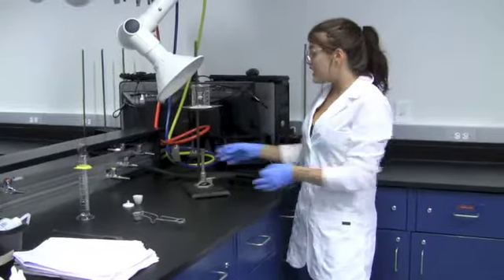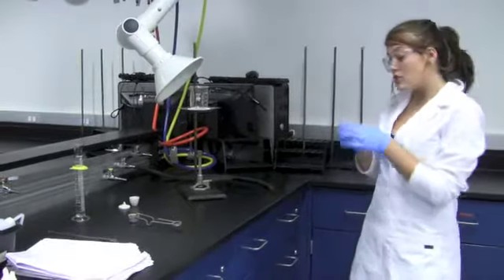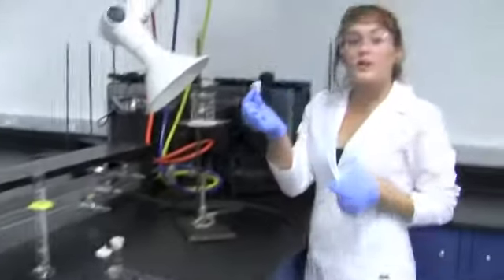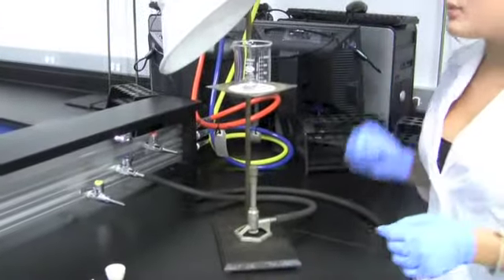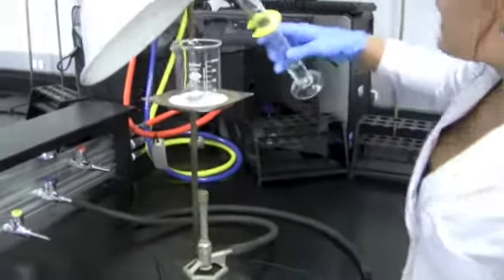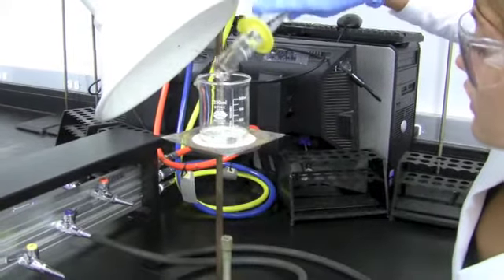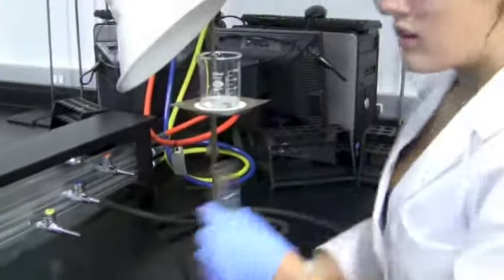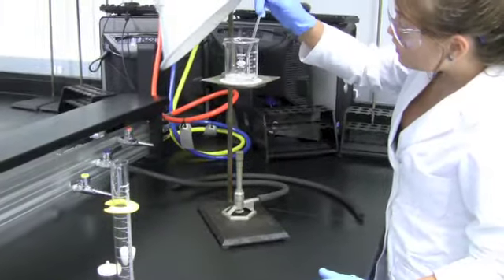So as you can see, I've set up my lab table so that nothing is close to the edge. Now to proceed with the experiment, I've folded up my aluminum foil. I'm dropping it into a 250 milliliter beaker, and I'm adding 25 milliliters of my 1.5 molar potassium hydroxide. Now make sure that this is completely submerged by using your glass rod.